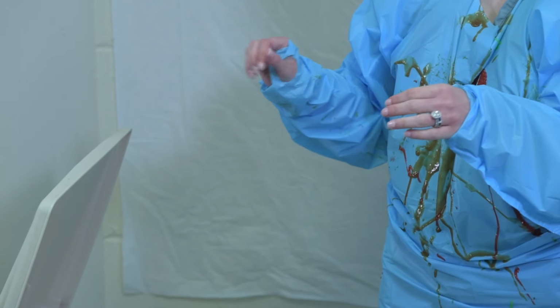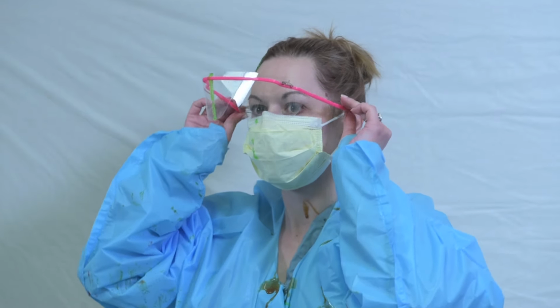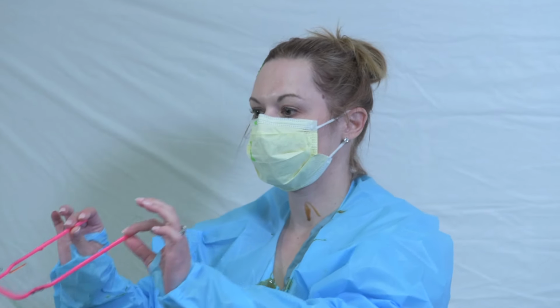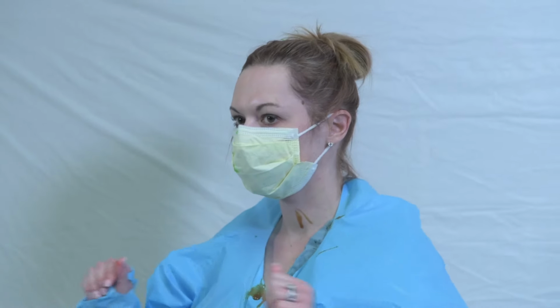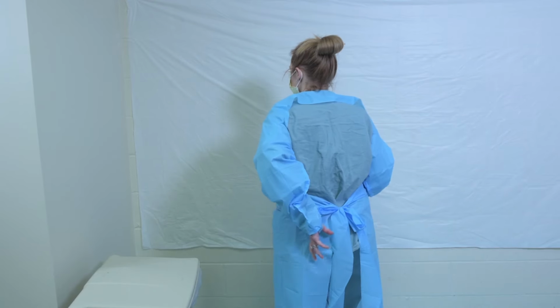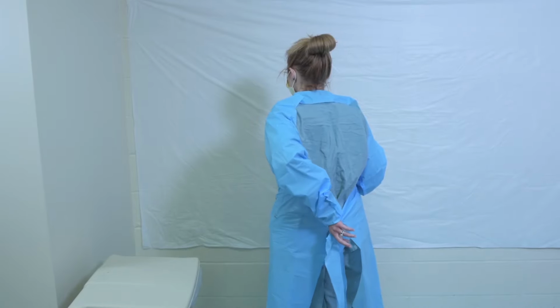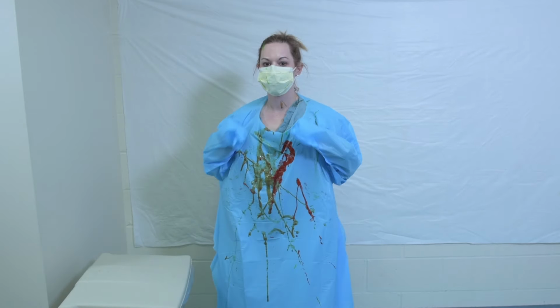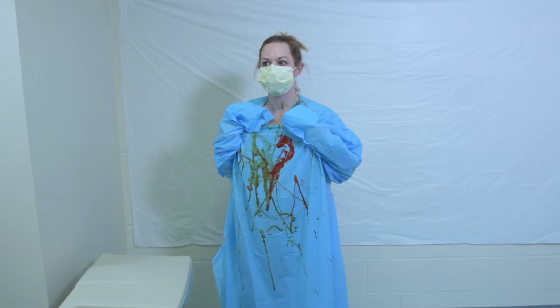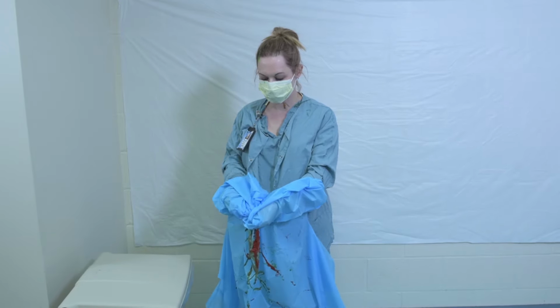Throw away. Remove goggles or face shield by holding the headband or earpieces to prevent hand contamination and throw them away. Remove the gown by unfastening the ties. Touch the insides only. And remove by rolling away from the body clean side out into a bundle and throw away.